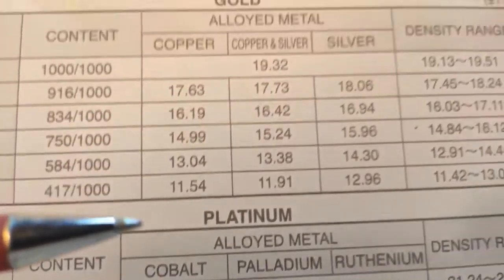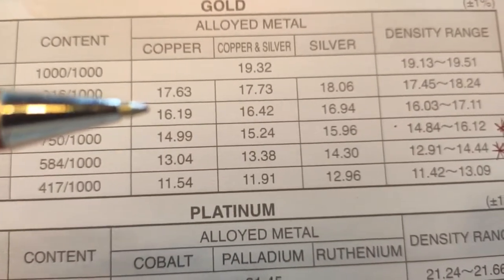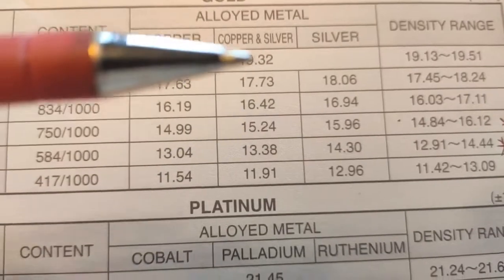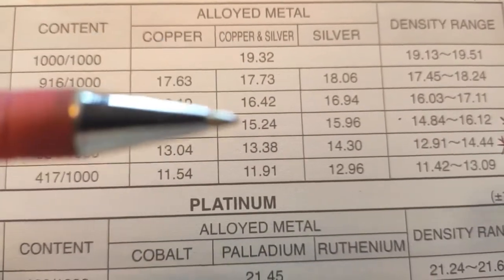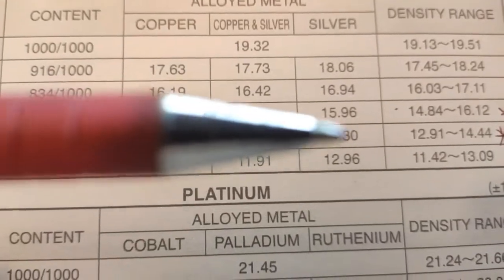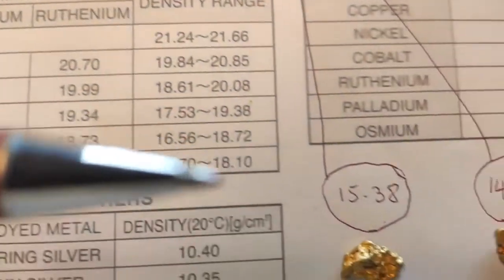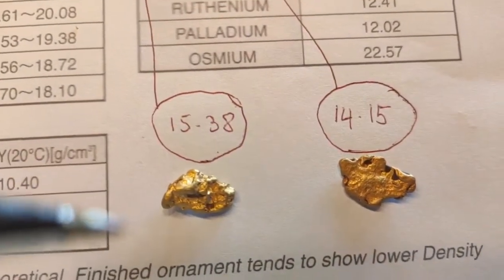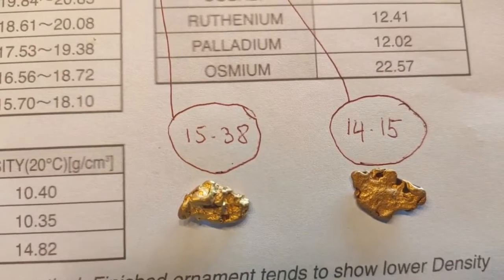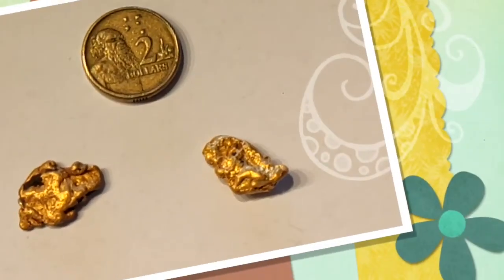The two pieces of gold also have different alloy combinations. Looking at the SG numbers, the bigger one has a copper and silver content, being closer to 15.24, and the other one has a silver alloy which is 14.3. These two pieces of gold were both found within the same area on the same field in the Victorian goldfields.